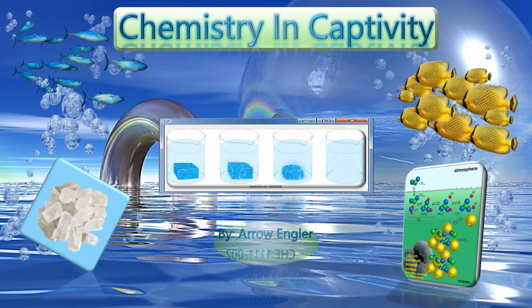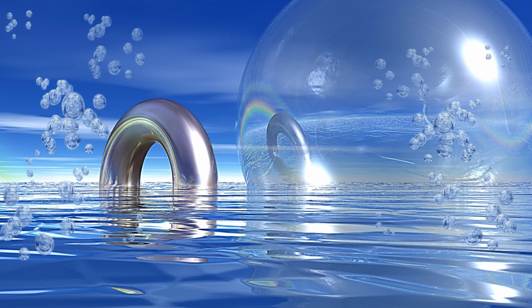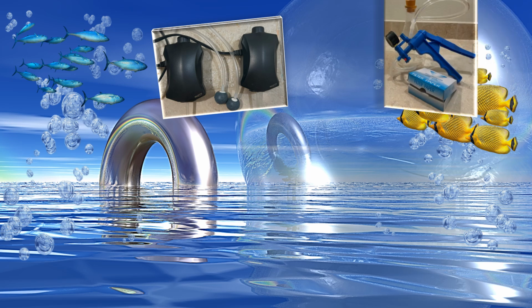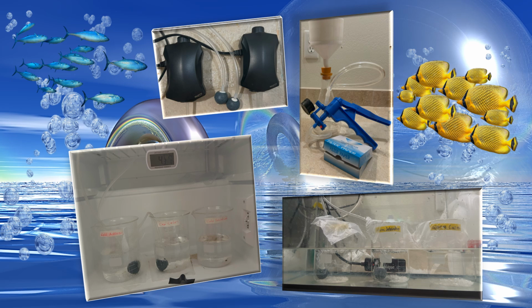Hello and welcome to my chemistry in captivity video. In this experiment, I will be focused on detecting and measuring calcium dissolution in seawater across different environments. I collect from two main conditions, hot water and cold water.